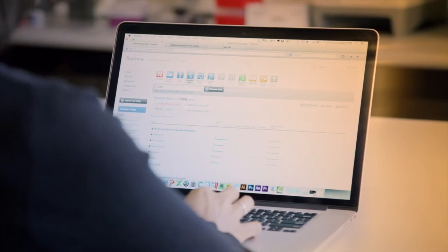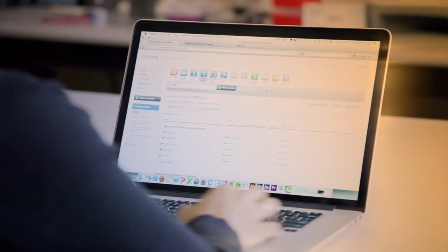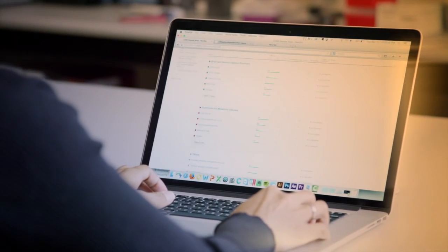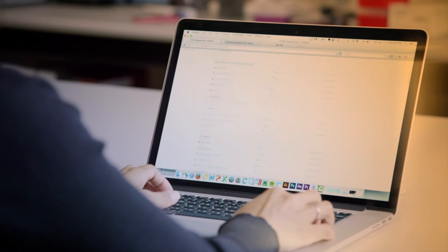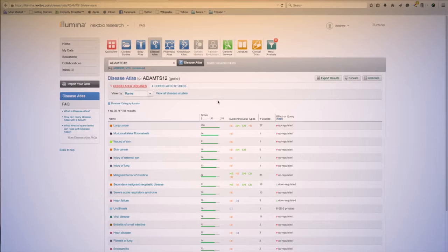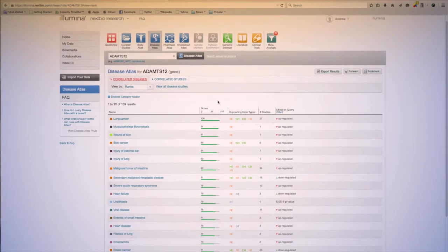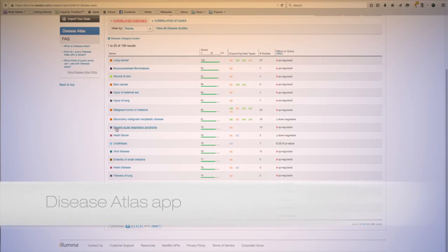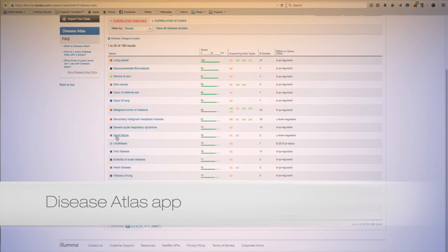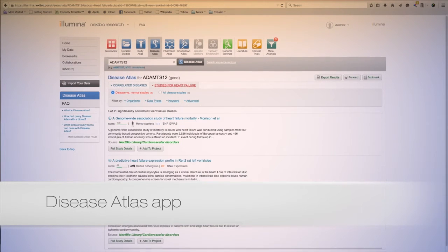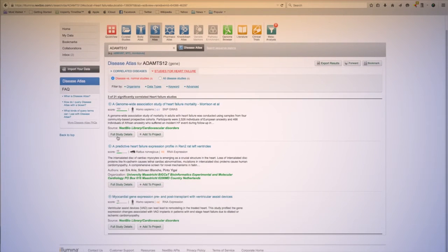Locate diseases, traits, conditions, and surrogate endpoints associated with a gene, sequence region, SNP, biogroup, or bioset with the Disease Atlas app. Organize your results easily based on disease and statistical significance.